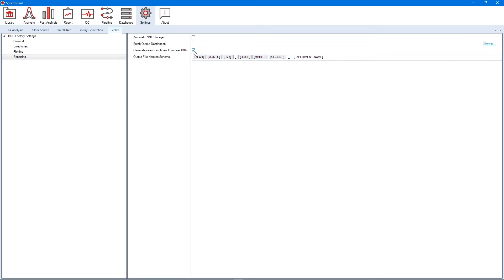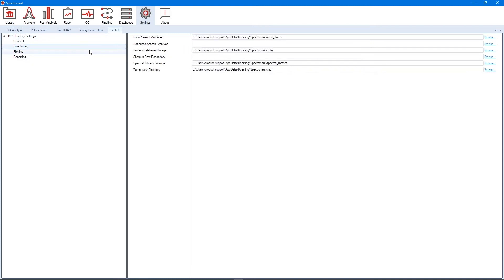Once checked, this option will persist even upon software restart. As usual, make sure that your local search archives directory points to a local drive with sufficient storage capacity.